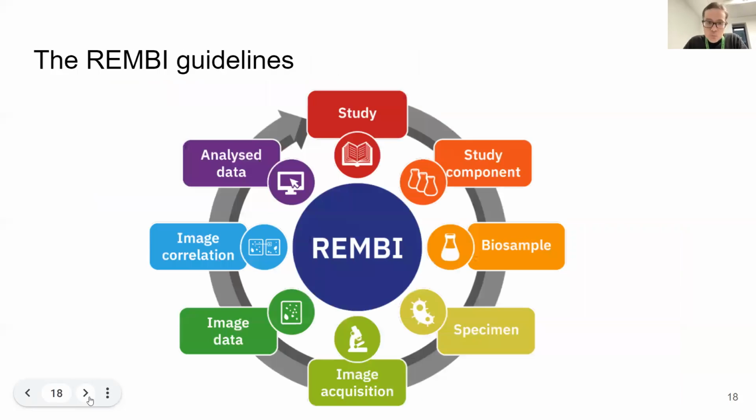Next slide, please. In order to develop a metadata model that is very broad, because one of the problems with trying to cover the whole of bioimaging is that it's everything from light microscopy and electron microscopy to atomic force microscopy. We even have, for example, handheld camera images of insects. It needs to be quite high level to cover these different use cases, but it also needs to be deep in certain places.